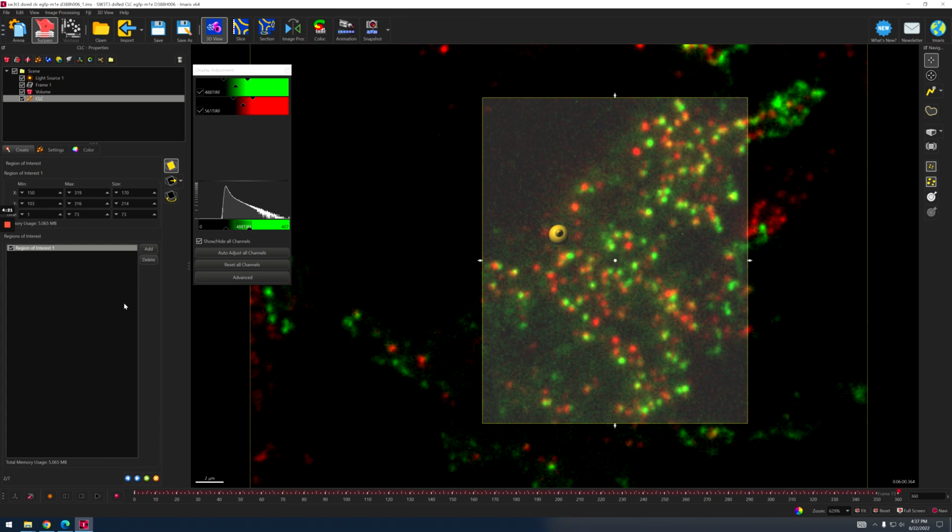And then I would recommend that you write down the ROI region that you selected, because you might need it for the green channel.